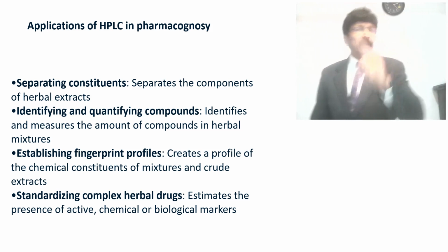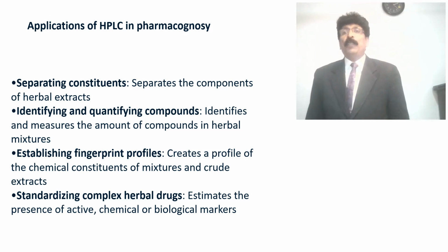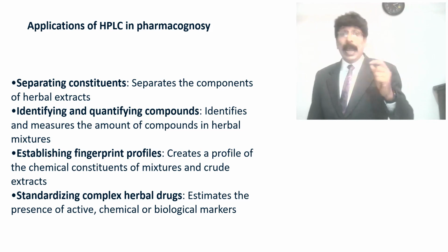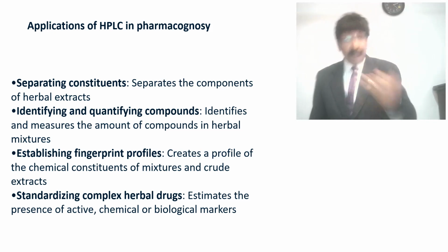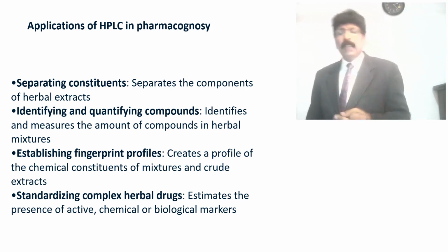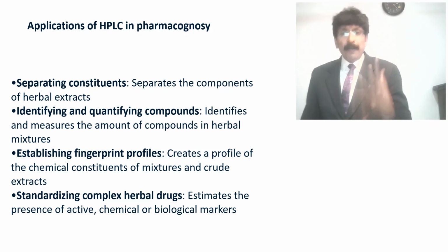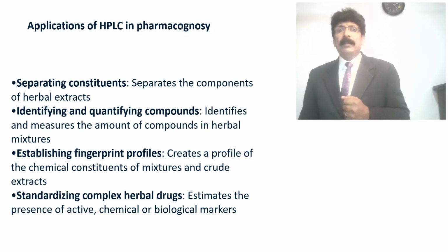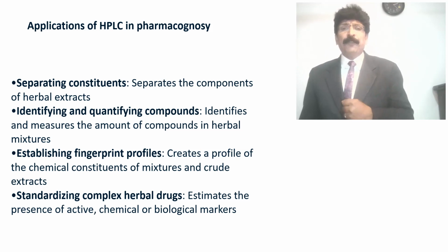This is an important issue specifically stated by the WHO. Multi-drug formulations: estimates the presence of active markers, chemical markers, biological markers. You may be knowing about the markers. These studies can be done using HPLC in pharmacognosy.